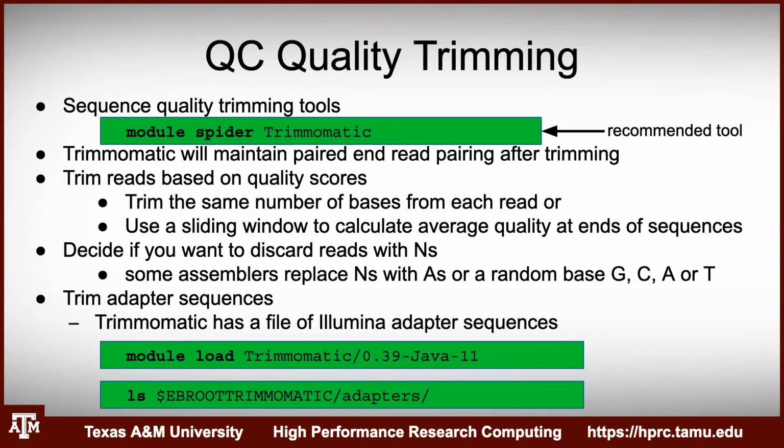If I trim off too much, too much adapter or too much sequencing, will there be missing information? Not if you're trimming just adapters. If you just do a default trimming, it'll trim for those adapters and low quality sequences, and it'll retain everything else. So you're not actually losing any information, because the adapter doesn't come from the genome, right? It'll just preserve what is true genomic or RNA sequence and map that.